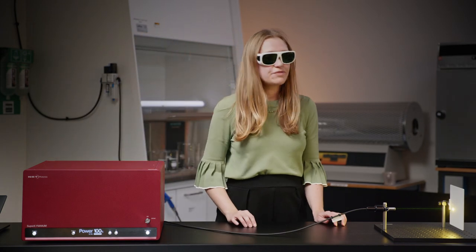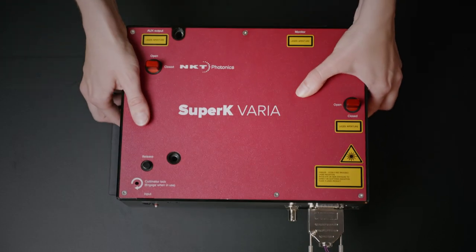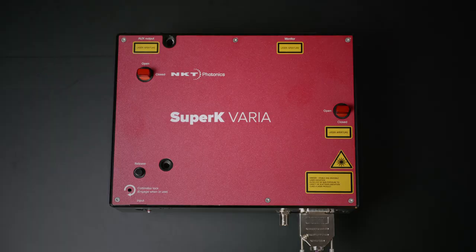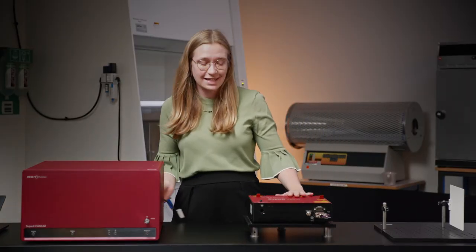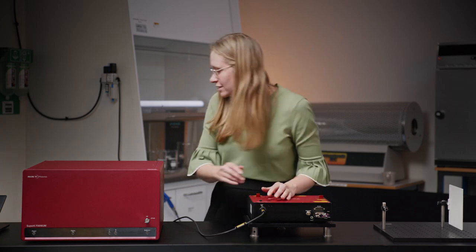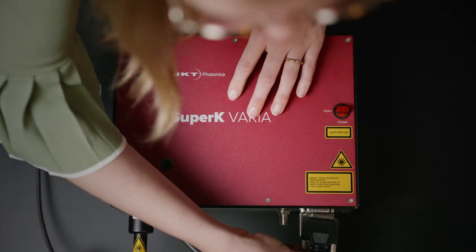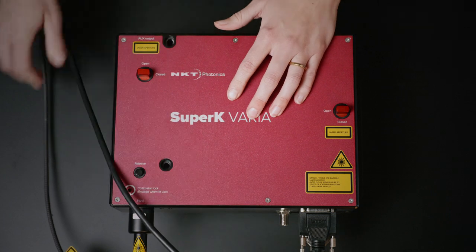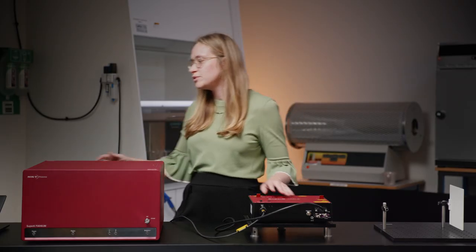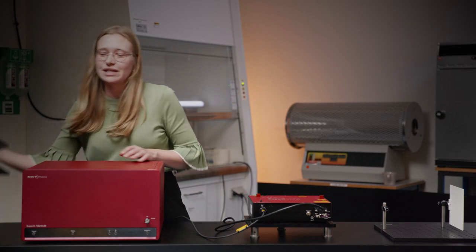If you want different colors, you can use it together with one of our tunable filters — for example, the Super K-Varia. To set up the Super K-Varia, you connect the laser to the input and make the electrical connections. To control the laser system, you use the control software that you can download from our website.